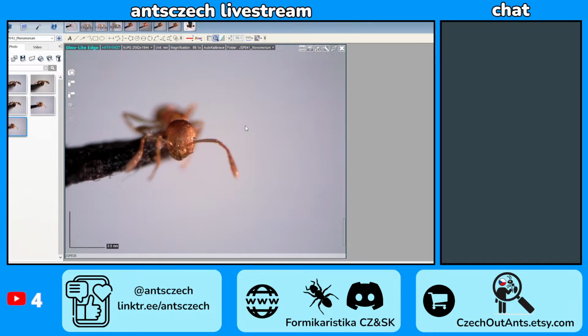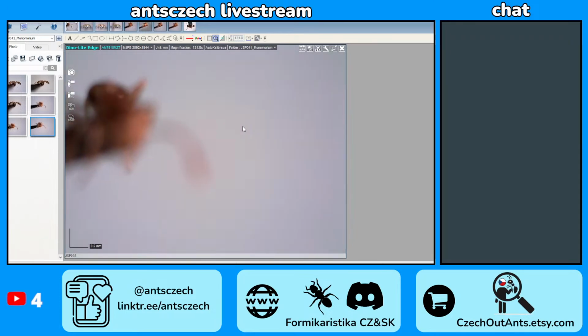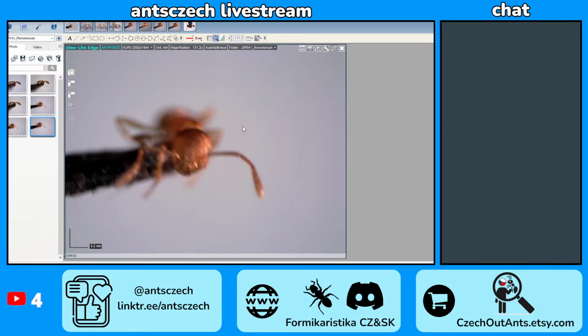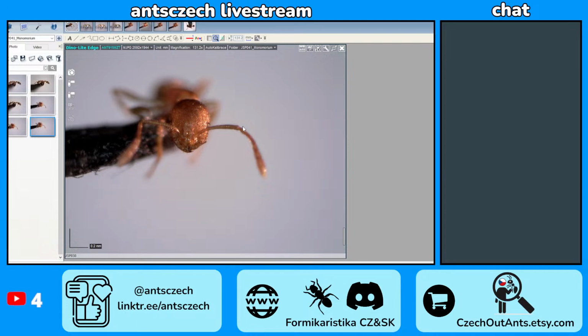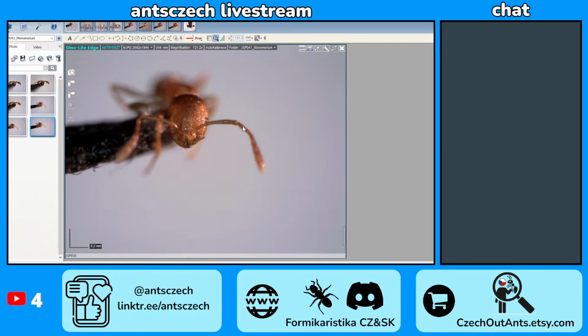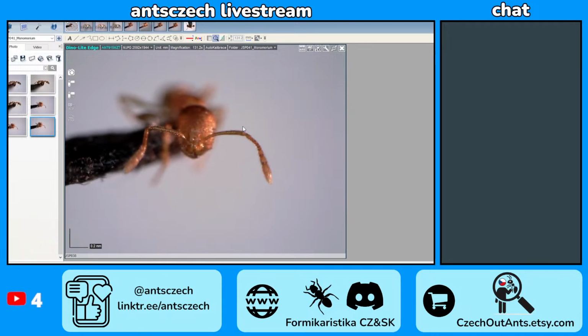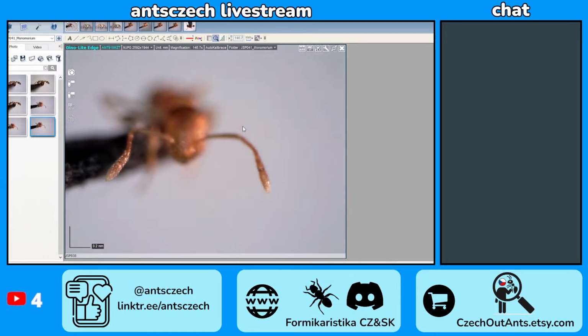Well, it's covering the eyes. Yeah, this is always painful with these small specimens. I'm glad I pinned 2 specimens and not just 1. For me, the big problem is that pinning them is also very painful, so I mostly just pin what I have.